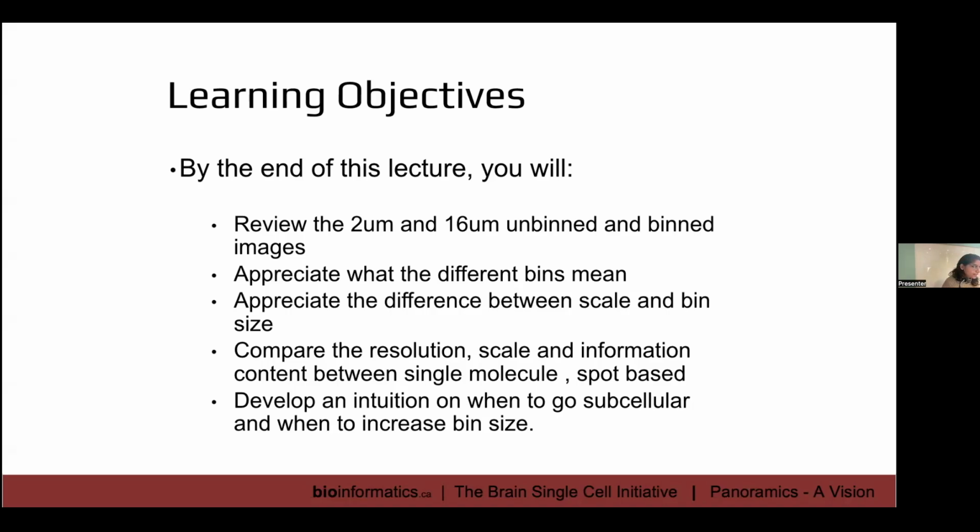So what is scale? When do you use scale? All right. What is bin size? When do you use bin size? So bin size is very, very different from scale. They are used very interchangeably. All right. And it's okay to use it interchangeably as long as you understand what is the potential of your bin and your scale. So that is the take-home message, because that is going to actually allow you to make smart choices about segmentation, to make smart choices about a platform.